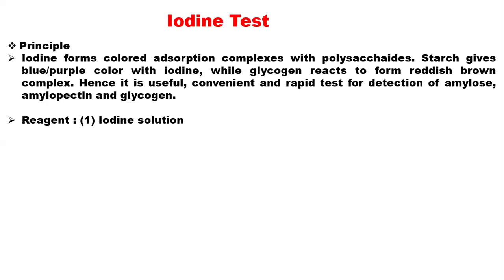Okay, so here you have a range of colors that you will observe at the end of the day, ranging from pure deep blue to deep purple, and that is for starch. It also depends on the proportion of the amylopectin, which I explained is the branched polymer of the starch.